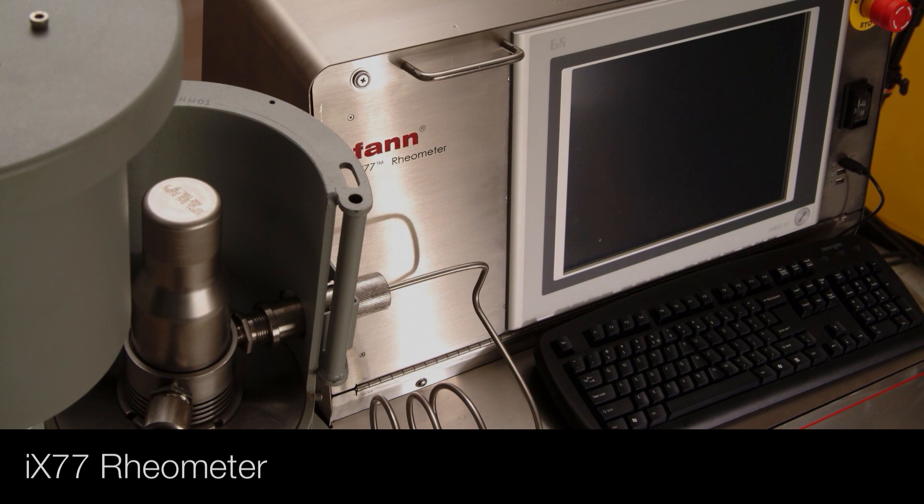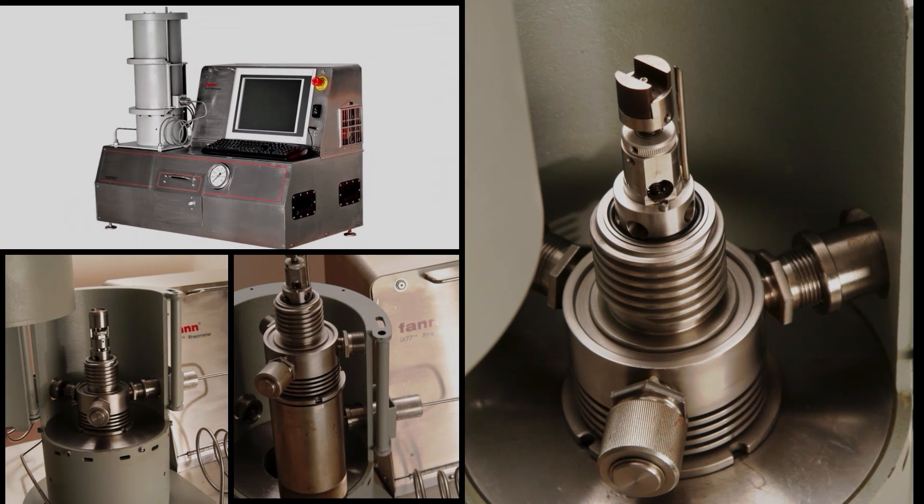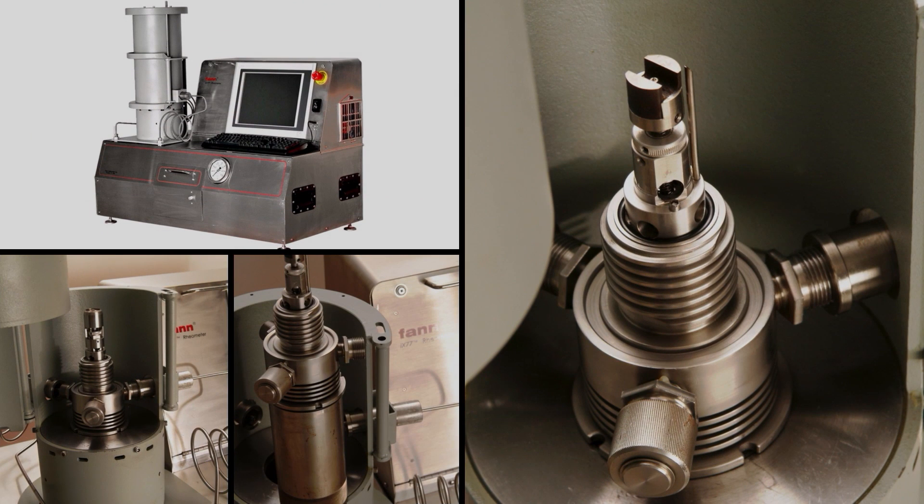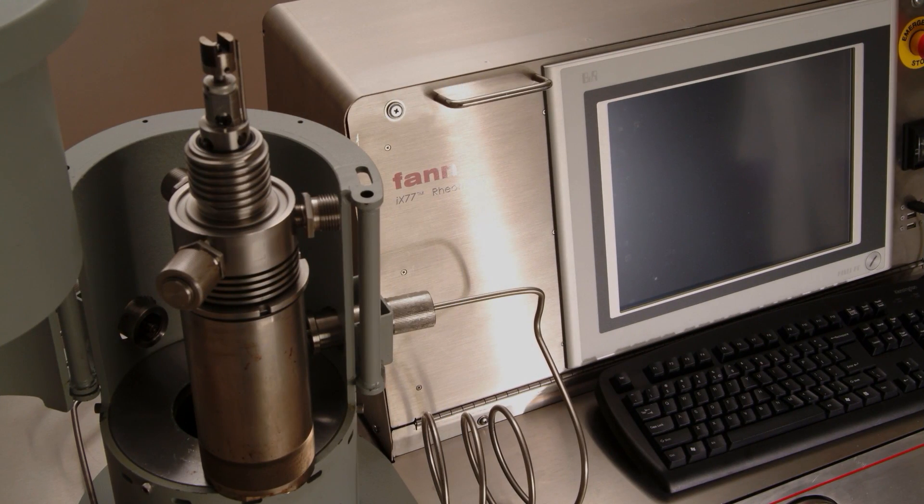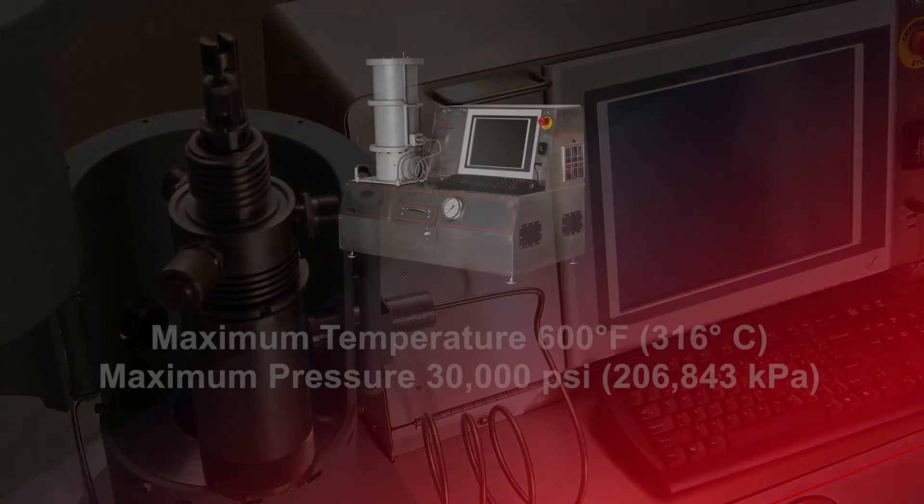This is Fan Instrument Company's IX-77 HPH-T Rheometer. This instrument was developed to measure fluid rheologies under high pressure and high temperature conditions with an emphasis on safety.